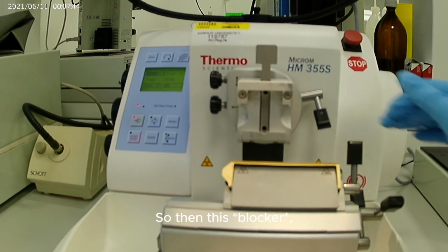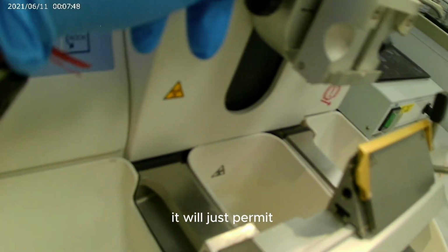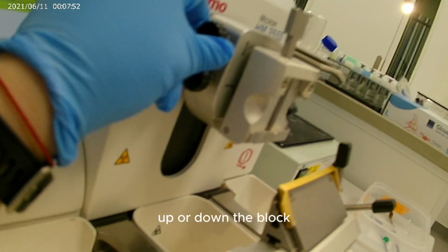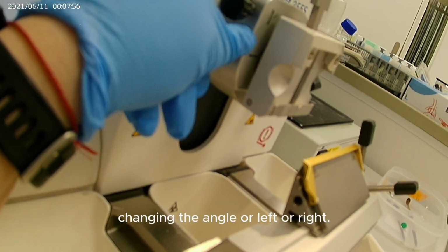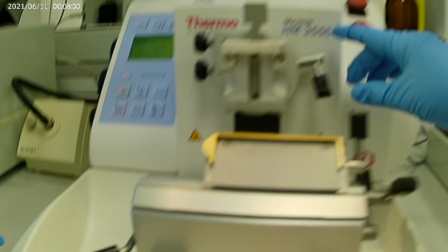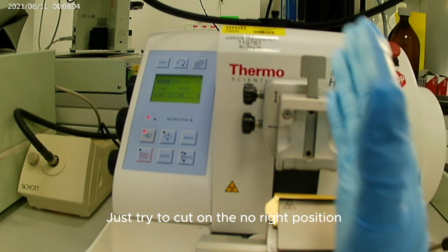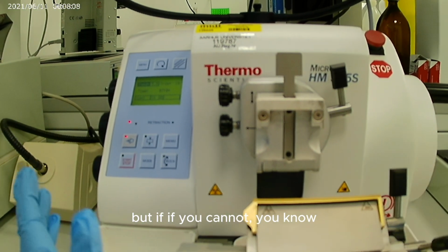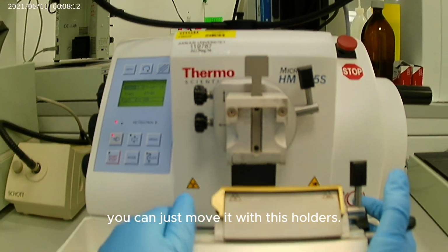So then this holder will permit you to move the block up or down with this wheel, changing the angle, or left or right. Just try to cut in the neutral position, but if you cannot, you can just move it with these holders.